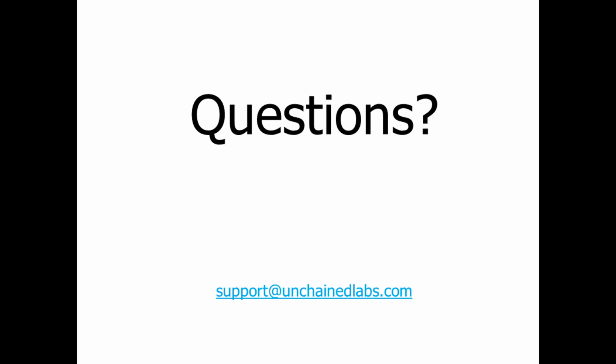Excellent, thank you. Another question here, are there any changes to the RAS server data browser? Nope.